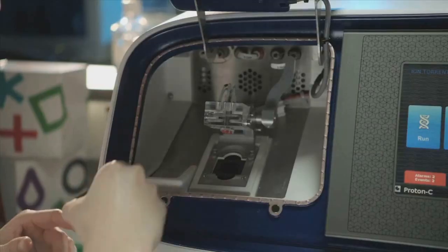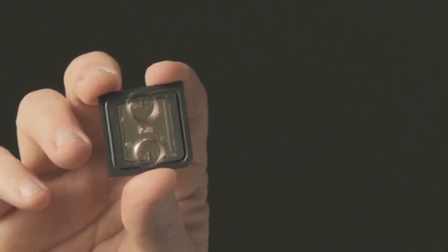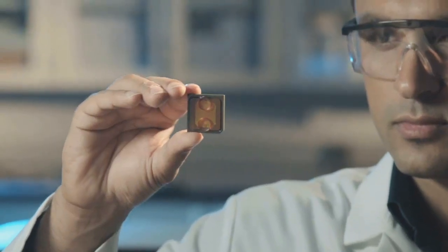The Proton works really at the core by semiconductor sequencing, and the beauty of semiconductor sequencing is it's really as simple as a CMOS chip. Every teenager who has a smartphone or camera phone has a little CMOS chip, and that chip has thousands of pixels that measure the intensity of light coming in to generate a photo. But instead of a sensor for light, it's a sensor for chemistry.